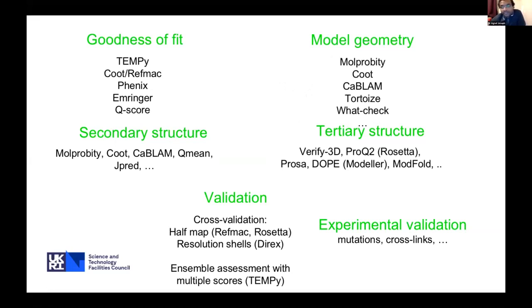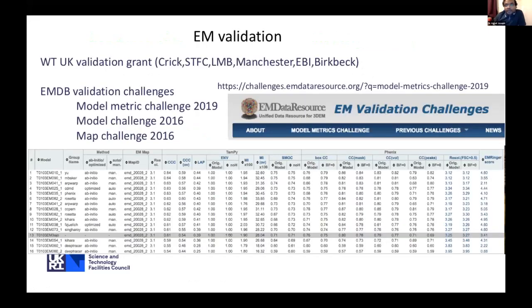So we essentially need a number of different metrics which are ideally quite complementary to each other, looking at different scales of features when you use models coming from different resolution data. And the EMDB model challenge is a very useful resource for looking at different metrics.